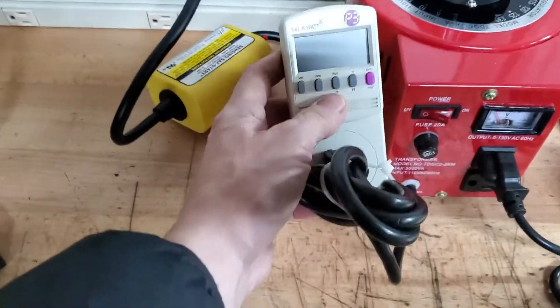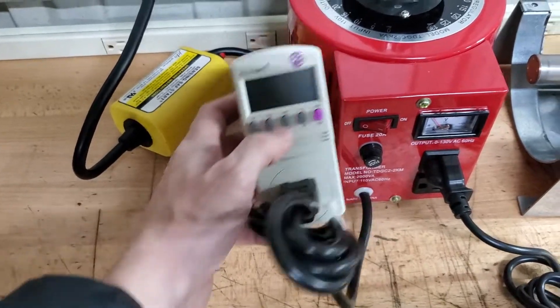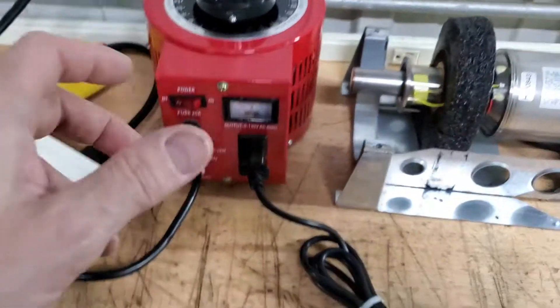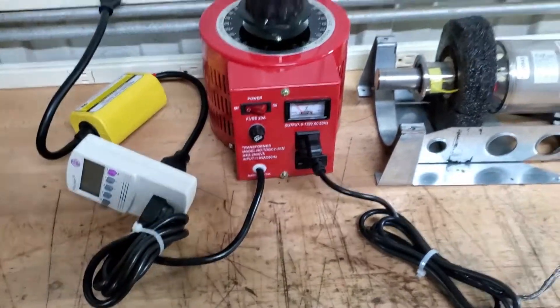To get to that on the meter, push — I think wattage — either once or twice for real-time wattage. You'll notice the wattage you want is the one that actually changes when you turn the dial on the variac.